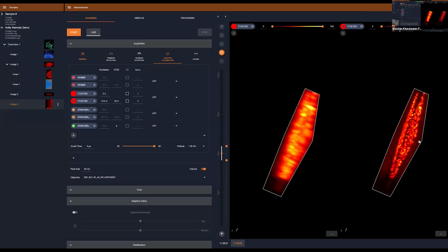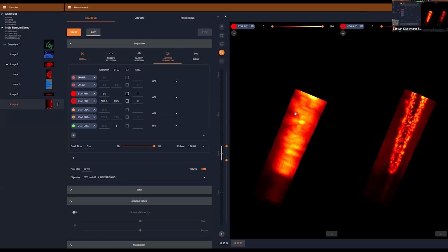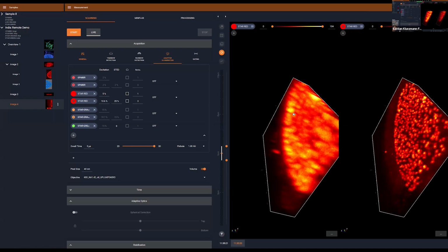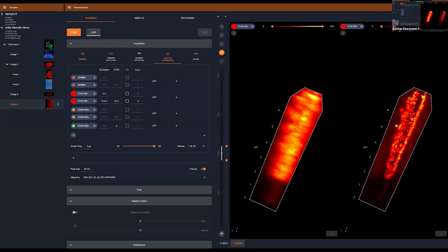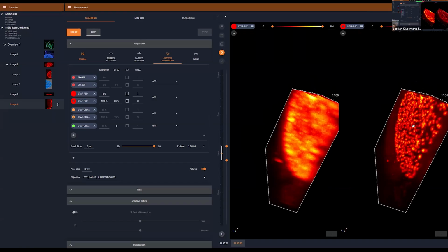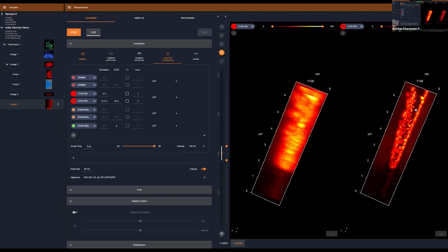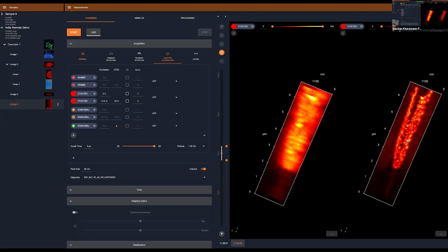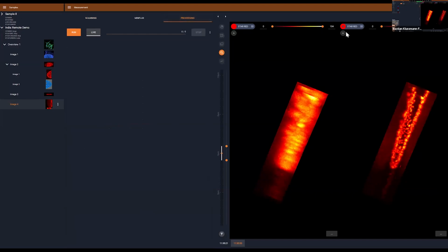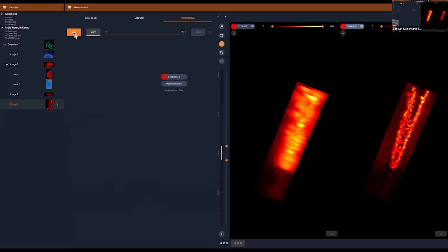And now you can see, okay, those nuclei are quite flat, and in confocal you kind of see that there are 2 different layers of nuclear pores, but here you can nicely see the individual nuclear pores and see, if you look from the side, this nice taco shape of the nucleus or of this area. Then again, I can go here and do a deconvolution.